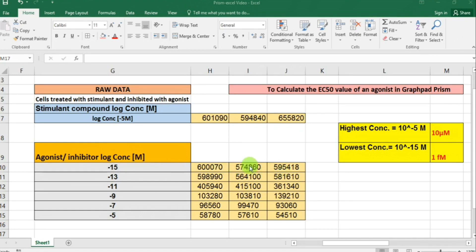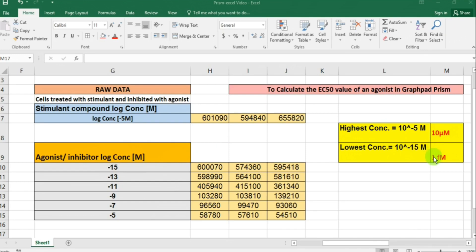My highest concentration is 10 raised to the power minus 5 molar, which we also call 10 micromolar. My lowest concentration is 10 raised to the power minus 15 molar, which we also call 1 femtomolar. Let's copy all this data and paste it into a Prism file to see how our analysis looks.